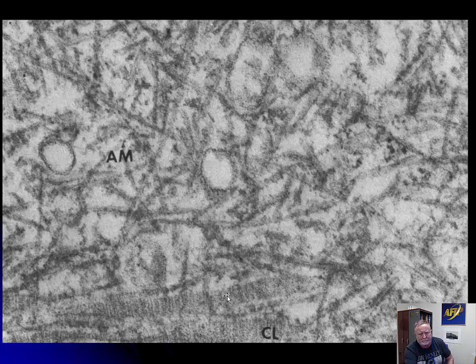And then the last one that I want to show you is amyloid. And amyloid, unlike fibrin, is haphazardly arranged, but it doesn't have that dense packing. Amyloid fibrils are generally very loosely arranged. Here are some collagen fibers so you can get a nice size comparison.